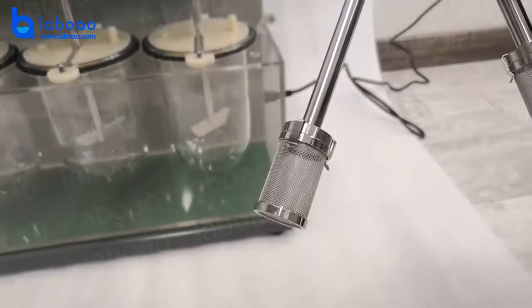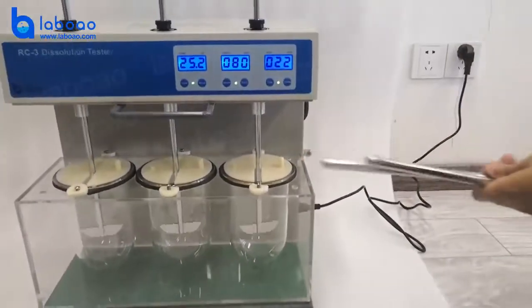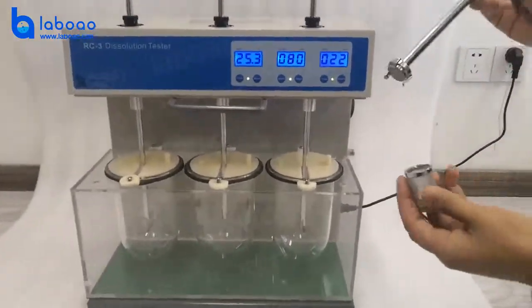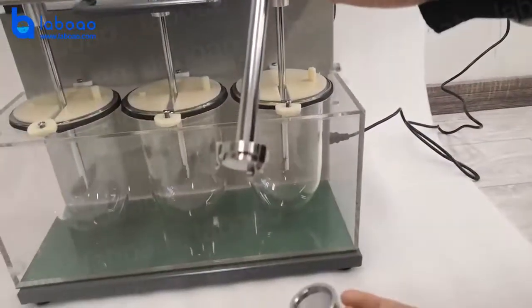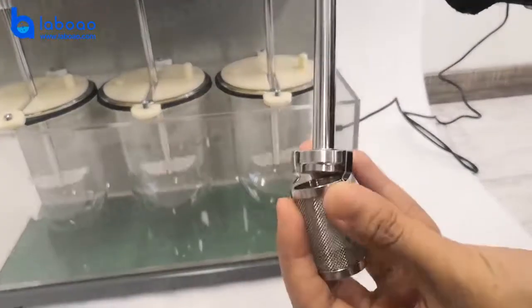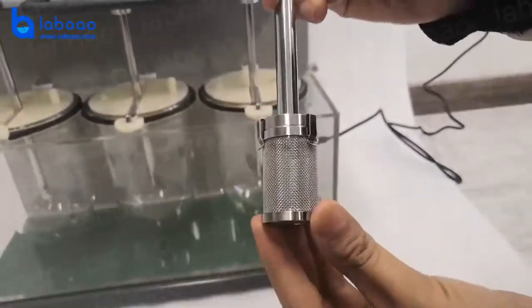This is another steering rod. Now I will show how to install. It is very easy. This is the basket and steering rod. And then fix. Very easy.